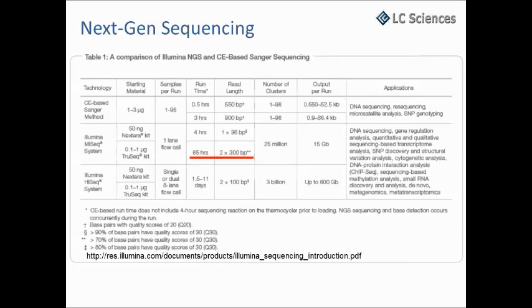So for 16S rRNA gene sequencing, we use the Illumina MiSeq desktop sequencer as our sequencing platform, and the length of reads can go up to 2 multiply 300 base pairs. That's a paired end read, and the maximum number from the MiSeq goes to 25 million reads.